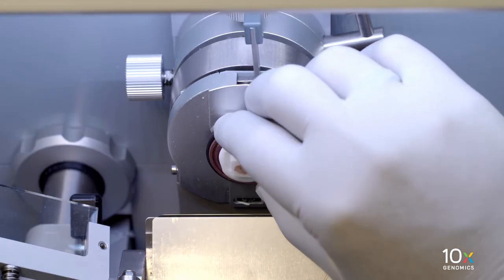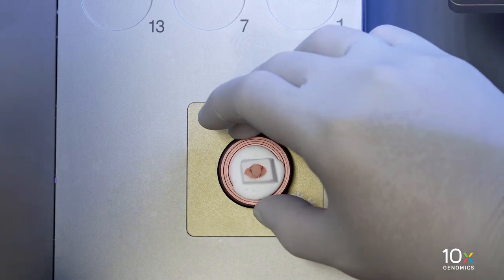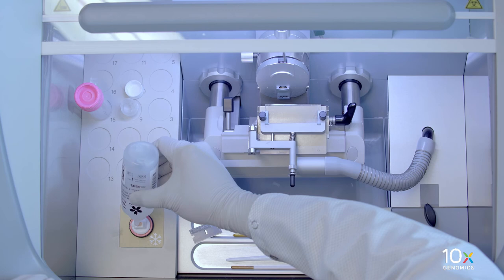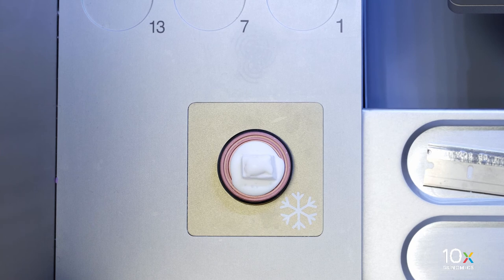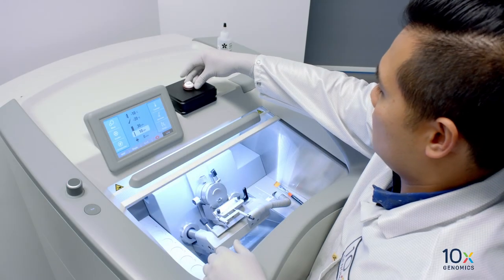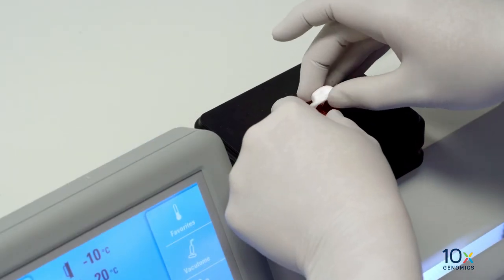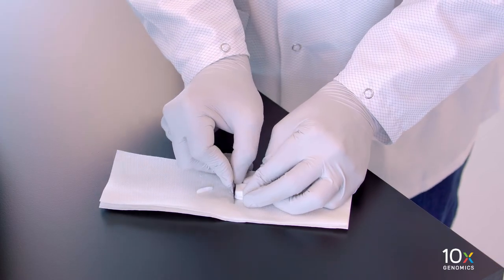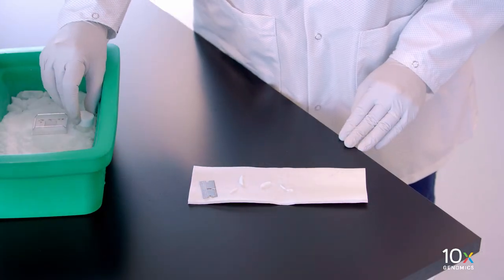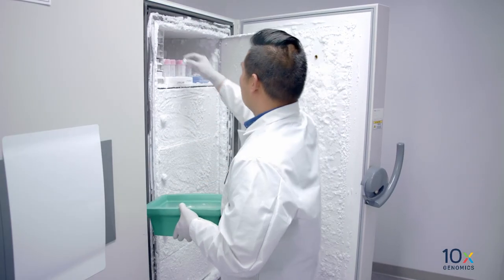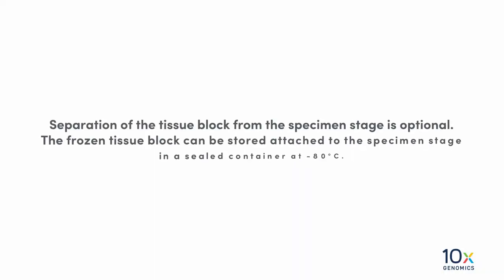Remove the leftover tissue block and specimen stage from the cryostat specimen head and place on the cryobar. Cover the exposed tissue with OCT and allow it to freeze. To separate the frozen tissue block from the stage, lift the tissue block and the stage from the cryobar and lightly warm the stage with your hands or an aluminum block at room temperature. If necessary, trim the tissue block to fit into a cryovial. Store in a sealed container at minus 80 degrees Celsius for long-term storage. Note: separation of the tissue block from the specimen stage is optional. The frozen tissue block can be stored attached to the specimen stage in a sealed container at minus 80 degrees Celsius.